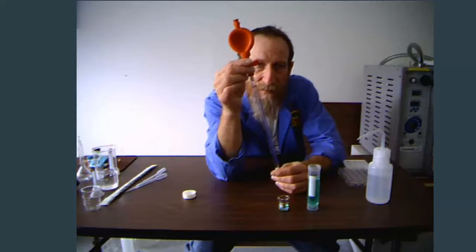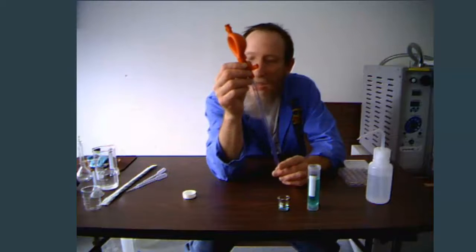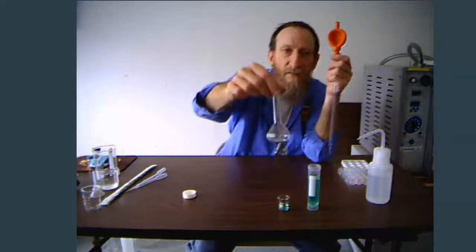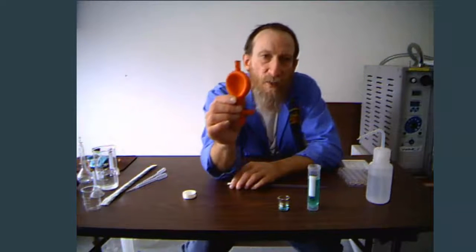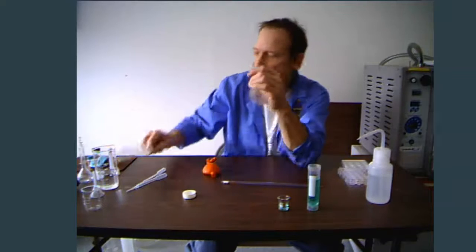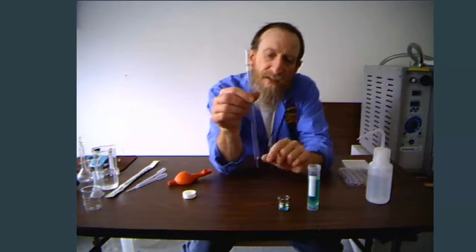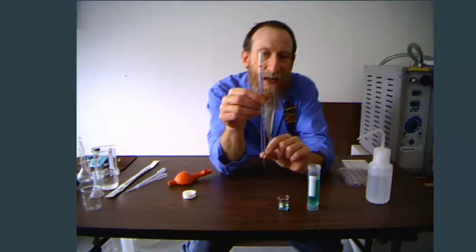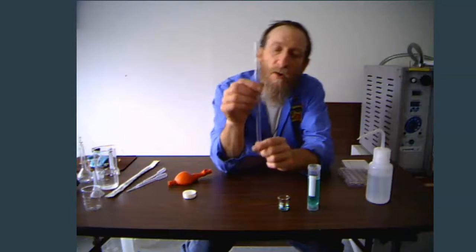If you wanted a precise amount, you would use a pipette — so this one is a graduated pipette with different markings on it. There are also volumetric pipettes that measure only a distinct amount, very similar to the volumetric flask. Graduated pipettes come in all different sizes: this one is a 2-milliliter graduated pipette, and this one is a 10-milliliter graduated pipette. It has two sets of markings — down here it has a 9, so that little bit at the end would be 1 milliliter, and it also has a 1 on there.